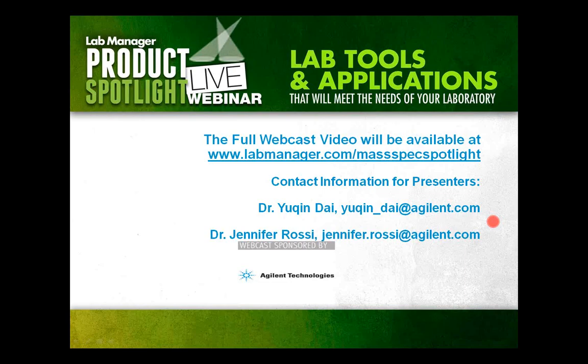So let's begin by talking about sample prep. I know that both of you did address sample prep a little bit in your talks, but can you elaborate a little bit about the key issues around sample prep, sample carryover, cleanup, and how attendees can minimize some of those problems?